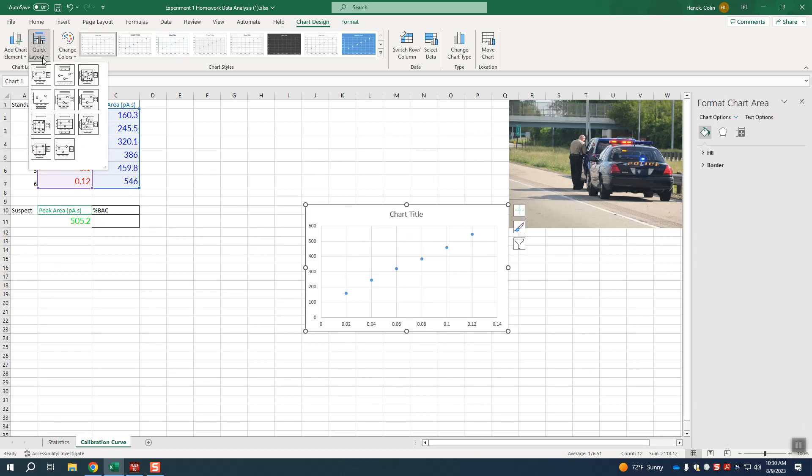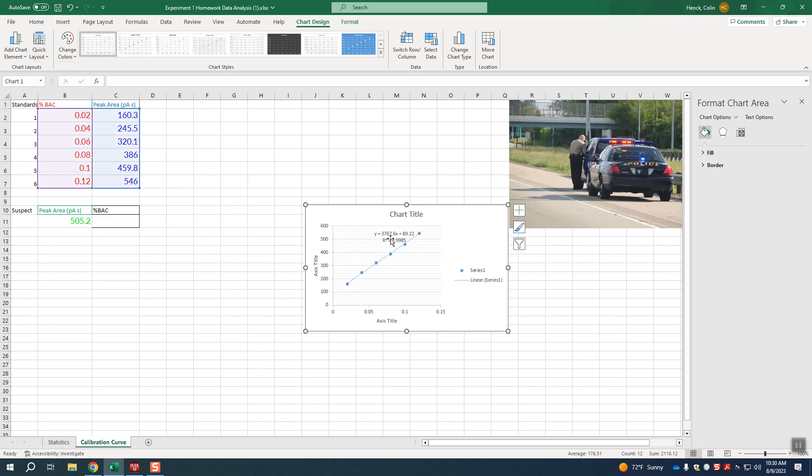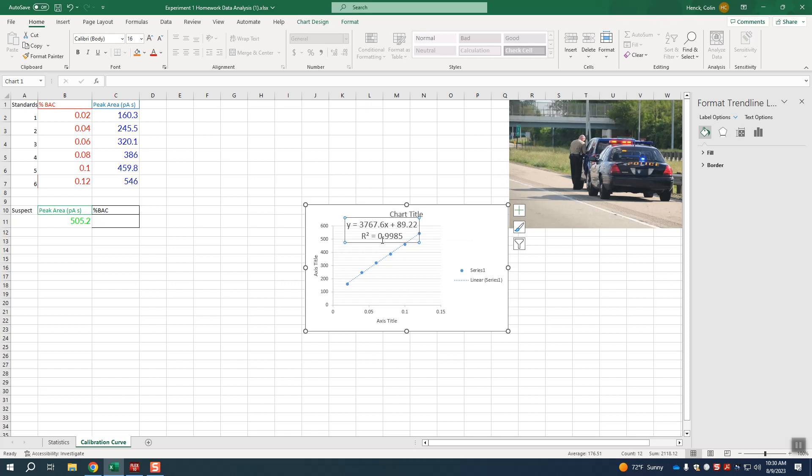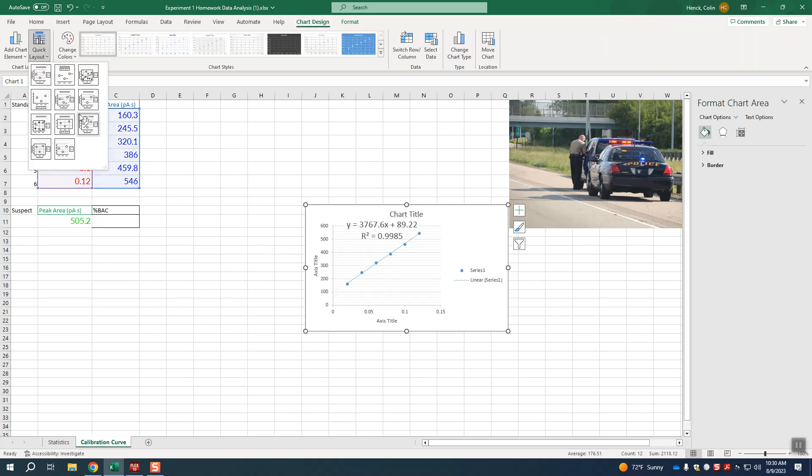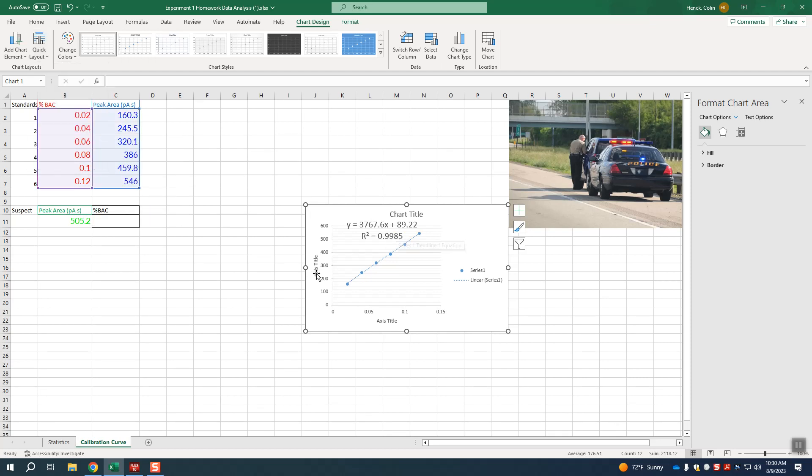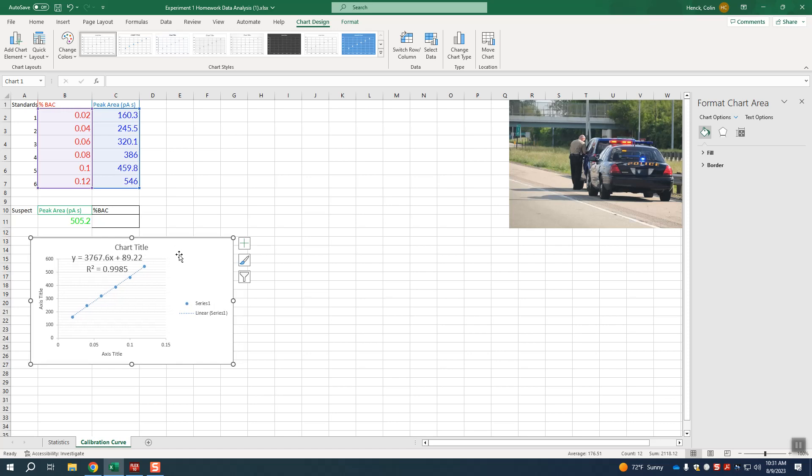But in this case what you can do is just click on the chart so that it's highlighted, go to quick layout, and if you click this one right here it will give you the equation of a line, which I'm going to make bigger. It will give you the equation of the line and the R squared. So again to do that you click on here, this chart design will pop up, you click on the quick layout, and you click on this one. It'll give you the equation of the line, it'll also allow you to title your axis, this would be peak area, this would be concentration of alcohol in the blood, and you get this equation of the line right here.